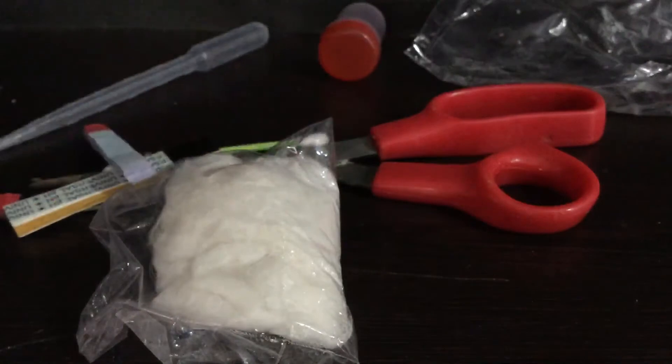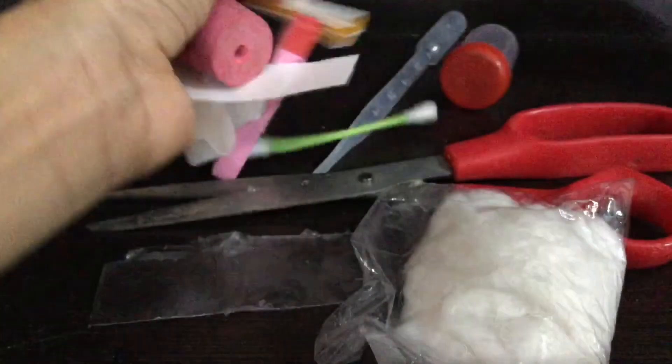Now we have to go to the second bag which is glass — be careful because it can fall. I'll take the second box and open it from here. We have to cut it very lightly. Wow, it looks good inside! Let me open it and show you, cutting from this side also. We'll take items out one by one.